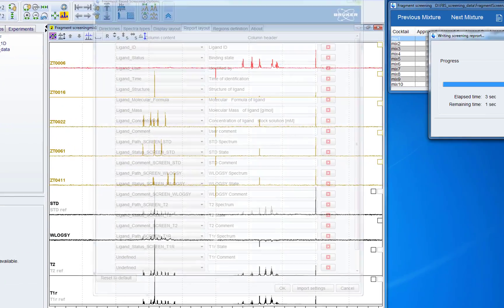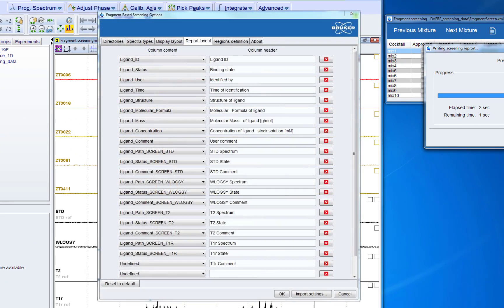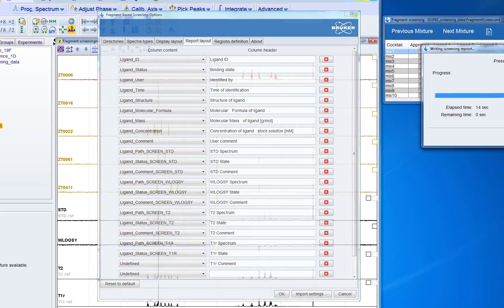The report layout can be changed in the configuration menu in which each line represents one column in the report. We can choose a header information and which information should go in this column.